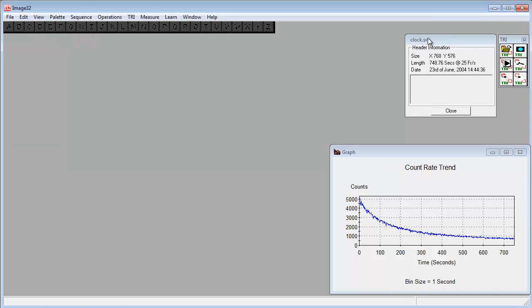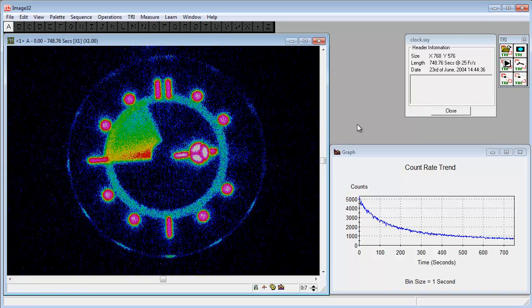As long as we have the dialog box open, the sequential XY format file is present in the system memory, and at any time we can reconstruct that file by pressing the load entire file icon. That rebuilds the image just so that we can see what we have.